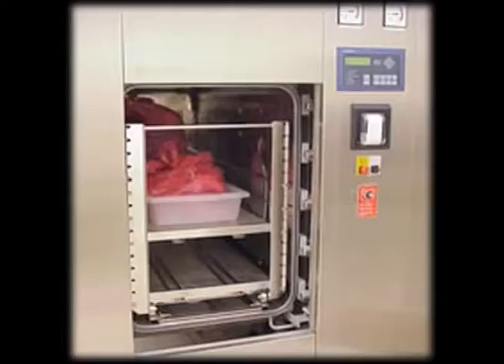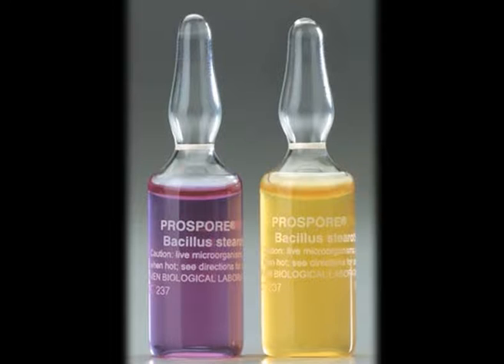So, what is done? A culture tube is taken. Within that culture tube, one ampule containing sterile media and a paper dipped with the spores of Geobacillus stearothermophilus is kept inside the autoclave.